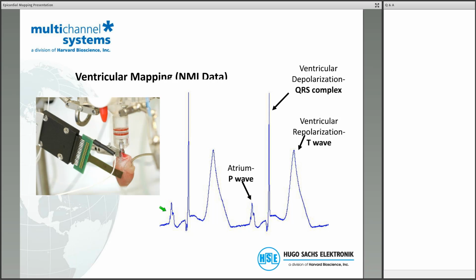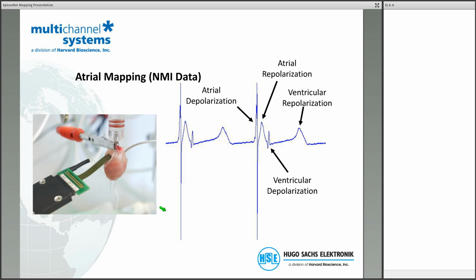So now let's position the same thing to the atrium. You see here we are pressing on the atrium, and you now see we have our huge rapid depolarization peak from the atrium here, and you see a very short signal. Atrial action potentials are usually just roughly below 100 milliseconds, and then you get a far field potential from the ventricular depolarization followed by the ventricular repolarization.